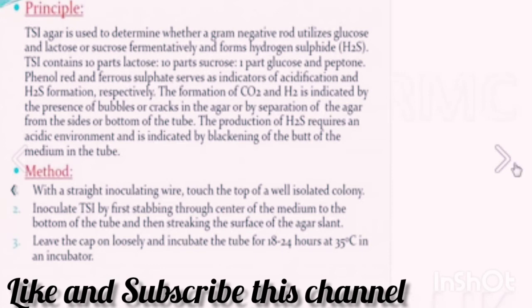TSI, triple sugar iron test. It is used to determine whether a gram-negative rod utilizes glucose and lactose or sucrose fermentatively and forms hydrogen sulfide. The formation of carbon dioxide and hydrogen is indicated by the presence of bubbles or cracks in the agar or by separation of the agar from the sides or bottom of the tube. The production of hydrogen sulfide requires an acidic environment and is indicated by blackening of the butt of the medium in the tube.